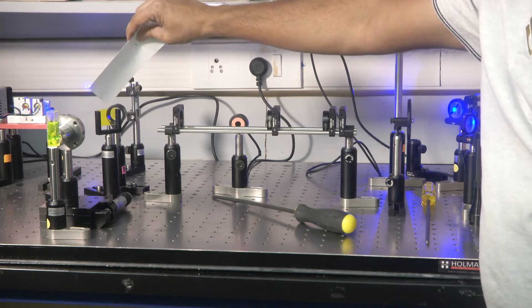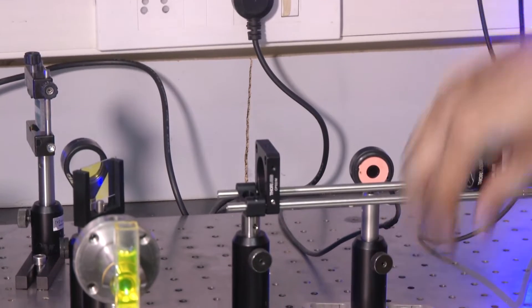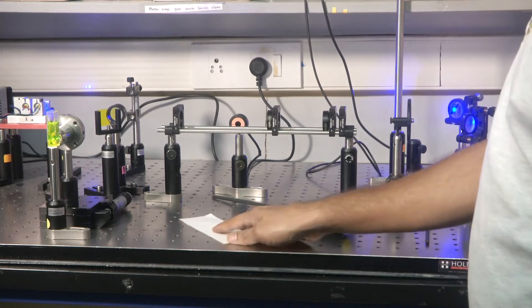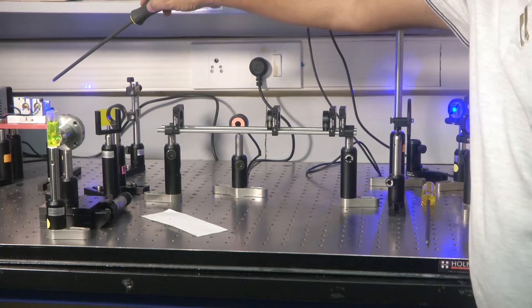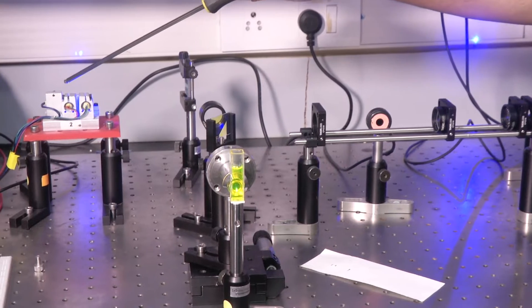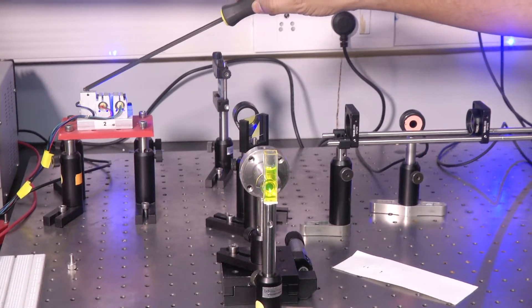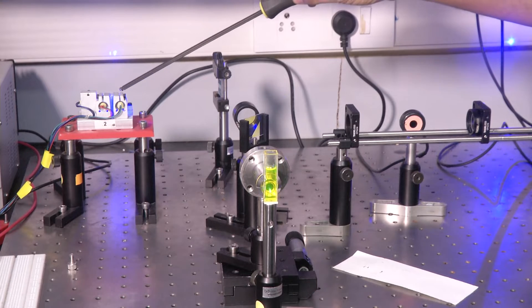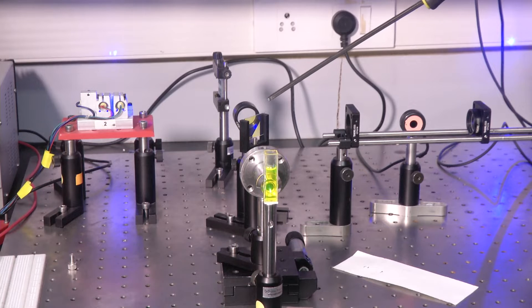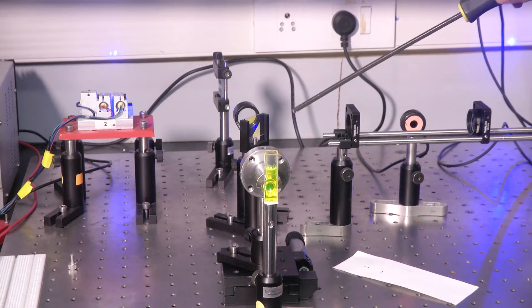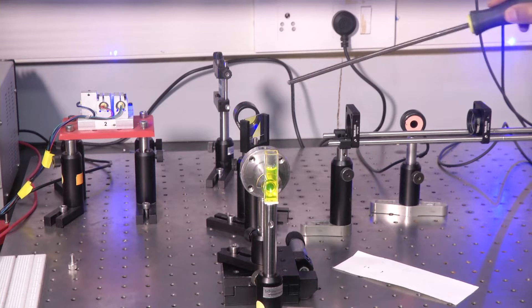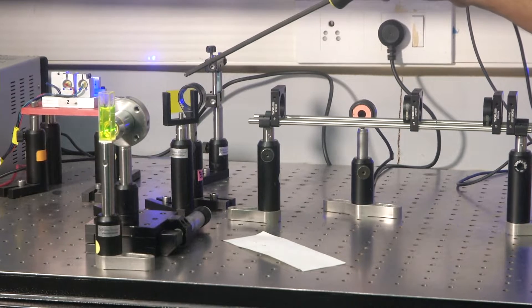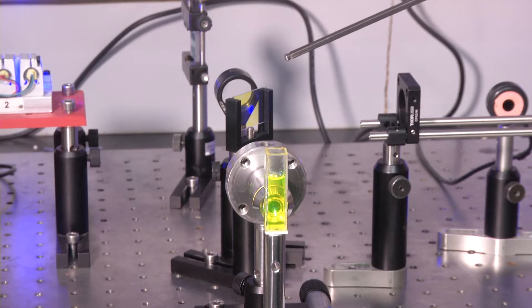This new optical element is a dichroic mirror. We have seen it in the class. It has a special property. These mirrors have a special property of transmitting certain colors while reflecting others. Now I have here used a dichroic which is going to reflect the blue laser, that 470 nanometer laser, and that laser light can be focused using a lens. It is going to reflect the blue laser and transmit the red-shifted, the Stoke-shifted green fluorescence.